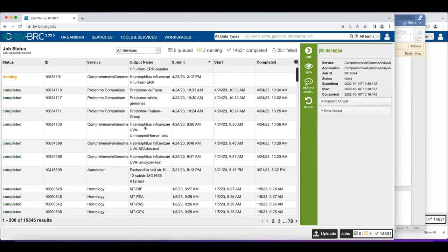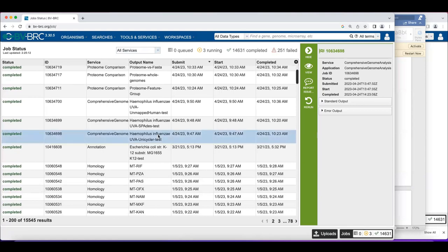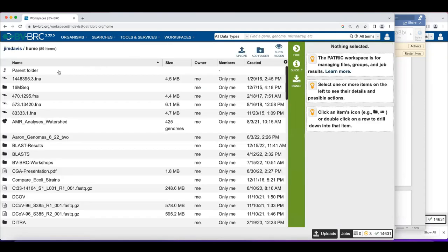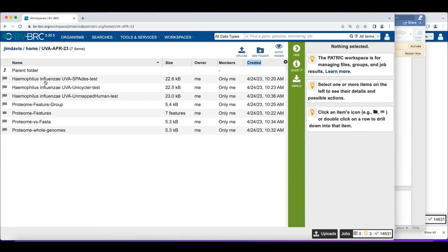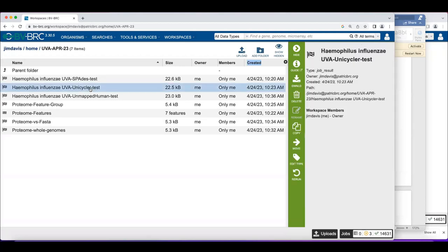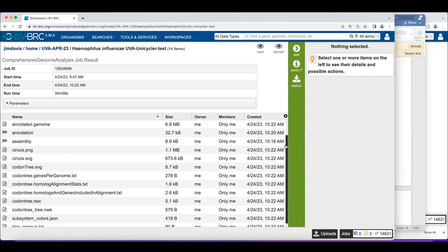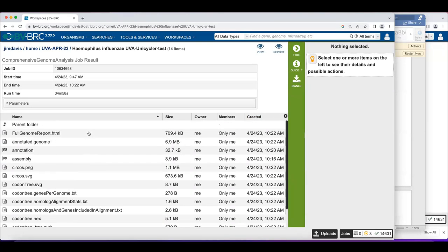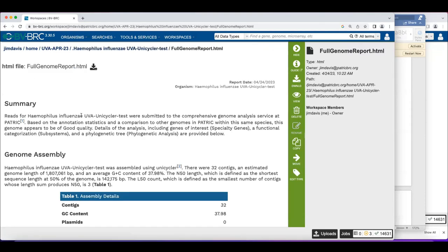Since these jobs were already run previously, I can walk through what the output looks like. From the jobs page, click the view icon in the green action bar. Or go to the workspace directory you used and look there — the checkered flag icon represents a completed job. Clicking on the Unicycler job gives a directory with two sub-directories: the assembly job, which ran first, and the annotation job, which ran second.